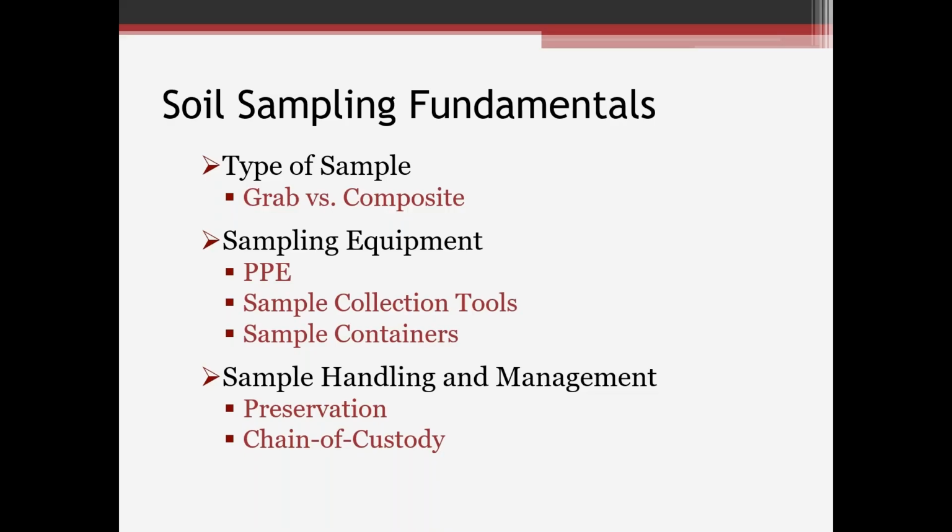Then you get into more of the extensive drilling operations where you might have stainless steel core samplers with liners inside them. That helps to keep your individual samples in disposable liners with an outer stainless steel macro core or core sampler that you can decontaminate. So all those things will help to keep your sample integrity intact and not have to worry about the cross contamination issue.